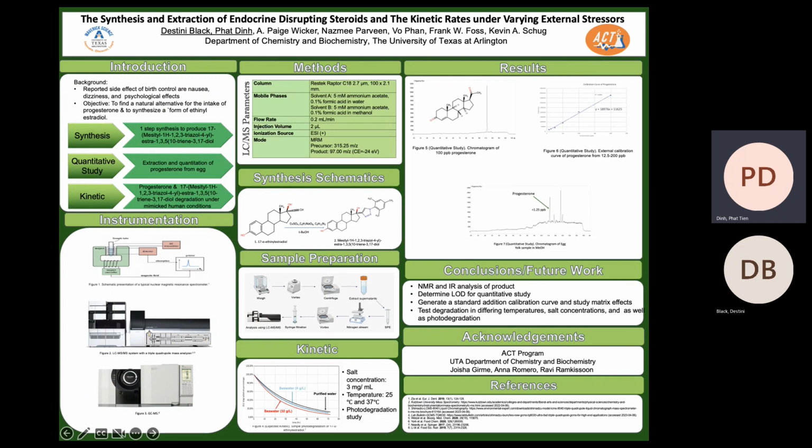As for instrumentation, we'll be using NMR to check our synthesized products. We'll also be using LCMS and GCMS for our quantitative and kinetic study. Currently, we only have our LCMS method due to the fact that our kinetic study is still ongoing. Nonetheless, our LC parameters are as follows.